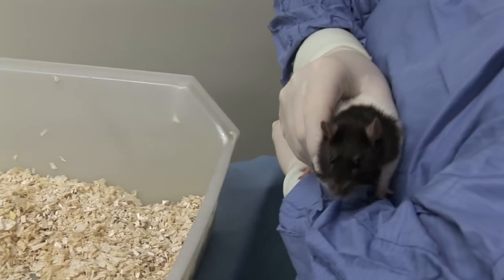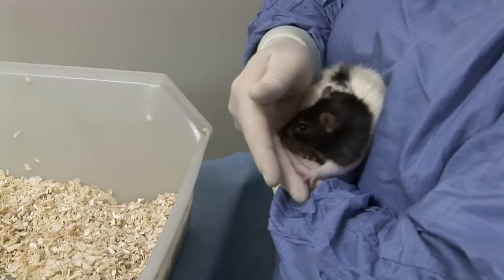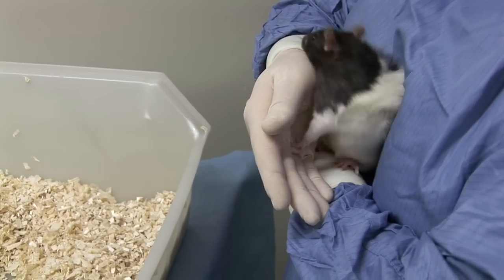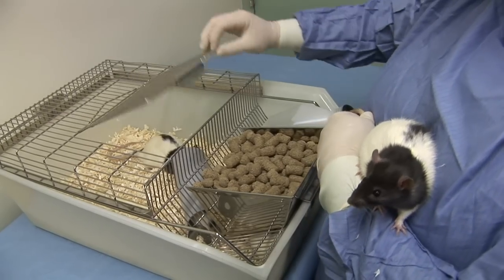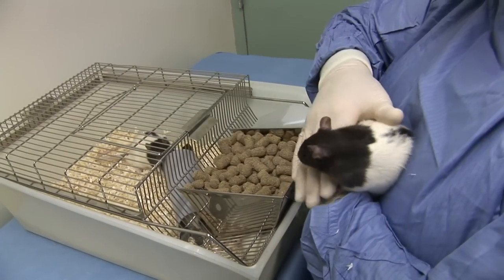It can then be held resting against your chest or arm while maintaining a gentle grasp around its shoulders and with its hindquarters supported. The cage lid may need to be replaced to avoid the other animals climbing out of the cage.